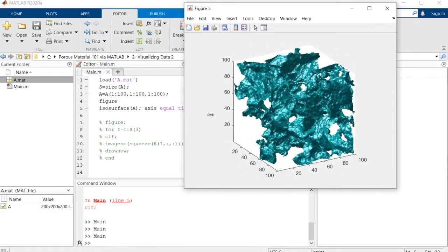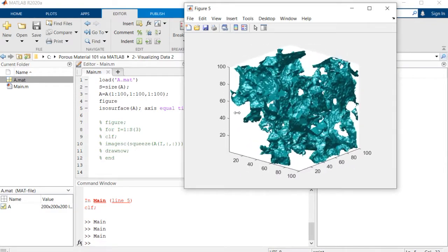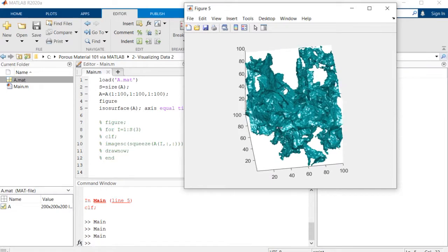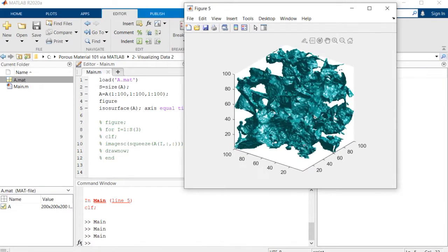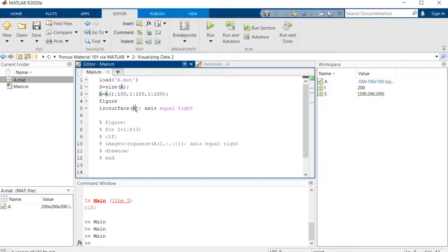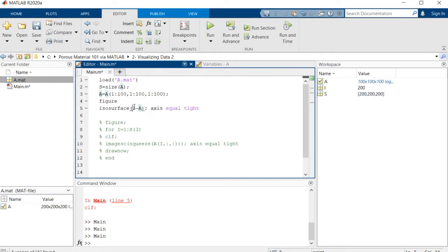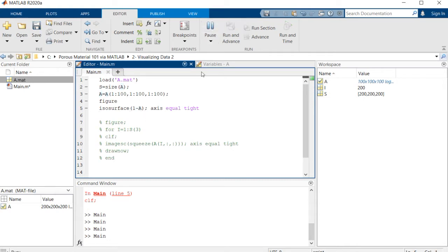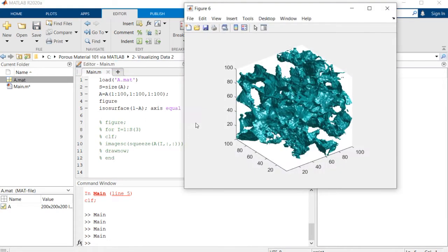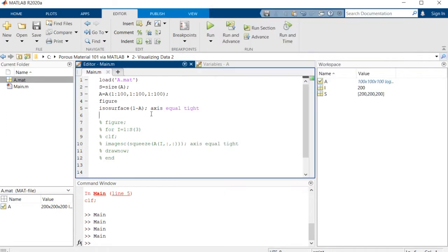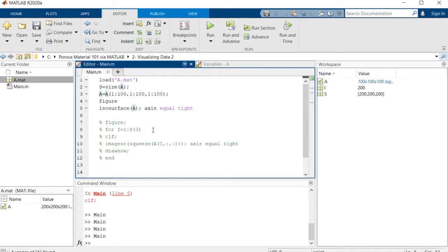This is good but it's not the best. We wanted to also be able to visualize the solid space which is here and we cannot see there. If you simply inverse these values by 1 minus a, you won't get the thing that you wanted because it just understands the surfaces.